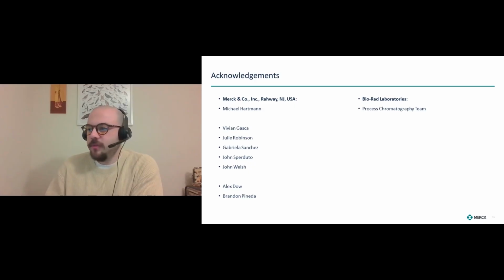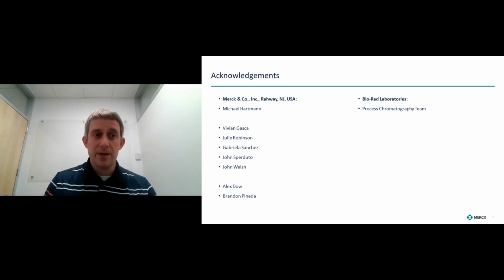The last question for the webcast is, were the 3 case studies performed at the same column scale across the control and Nuvia wPrime processes? So that's a good question. Everything that we showed for Nuvia wPrime 2A here was done on RoboColumn.